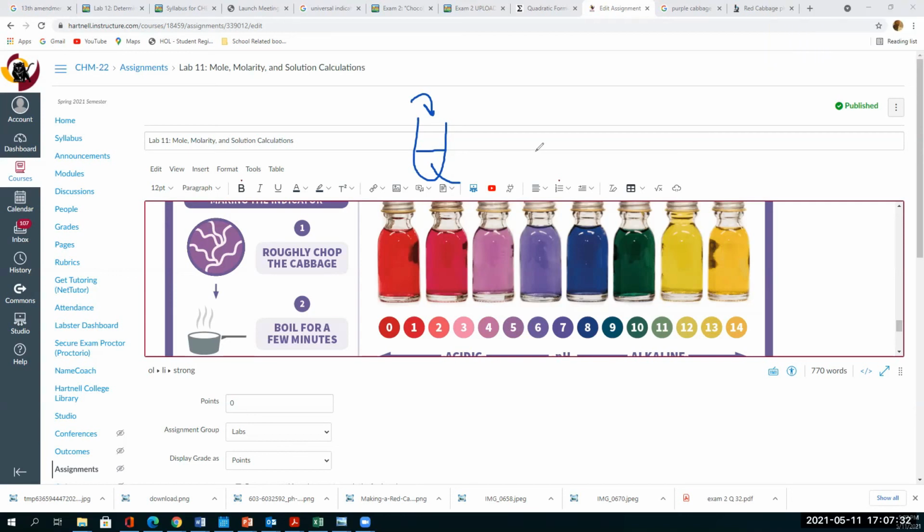Okay, Sienna. So after we solve for the number of moles, it's giving us a hint for the 98% citric and 2% ascorbic acid. Am I referring to using the percent composition? That's right. Good job. Thanks. I've been struggling this whole lab. But it's all coming together towards the end, right?